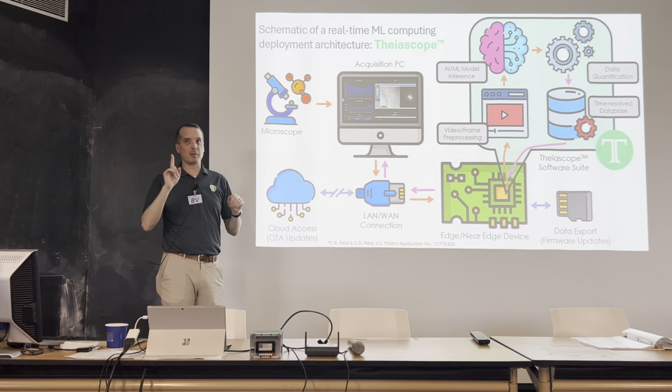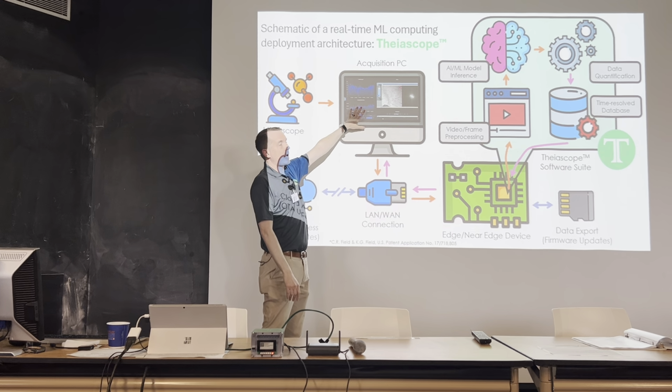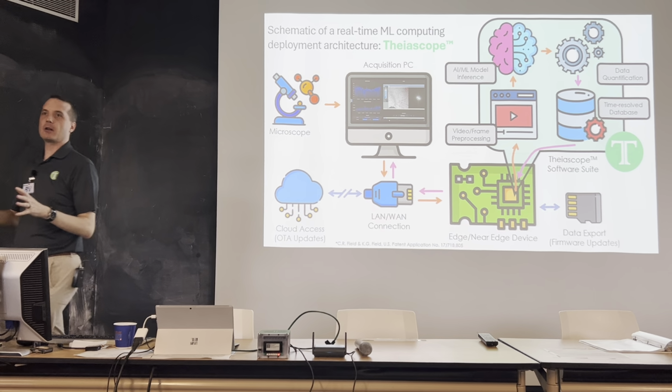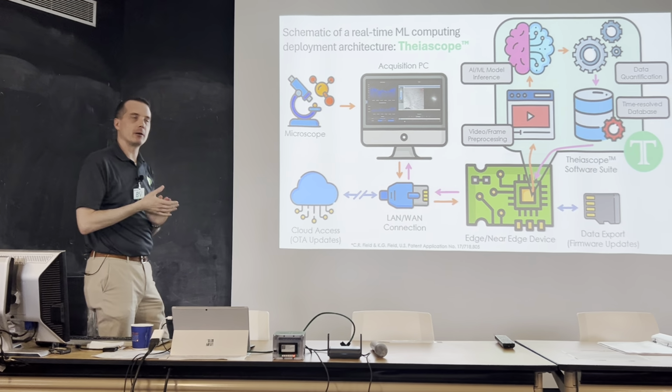We're finding out that that's happening more and more, but it's through a separate network and all that other stuff. But we can then also have on the acquisition PC, all you need is a web browser. So you don't even need to install software on the system because even Windows XP has a web browser built into it. So we don't have to void your warranty in order for this to happen.